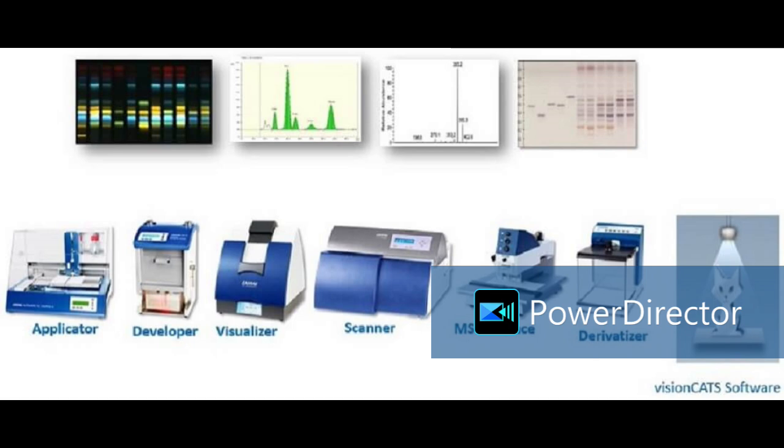Mostly in quality control labs and pharmaceutical labs, it is very useful, where methods are set: this is the mobile phase, this is the sample nature, this is the derivatizing reagent. Now proceed to analyze all this for batch to batch consistency, raw material analysis, finished product batch to batch analysis. We can use this very effectively.